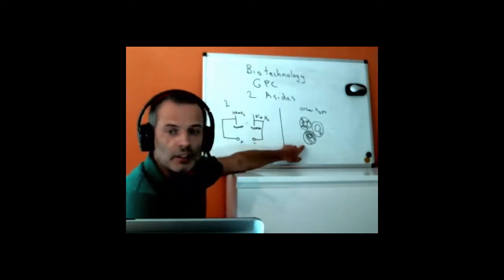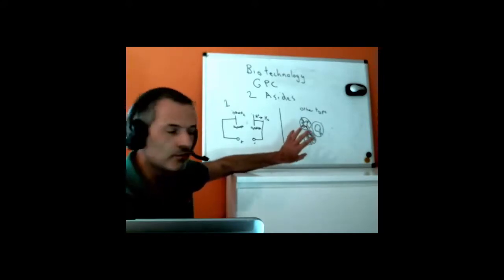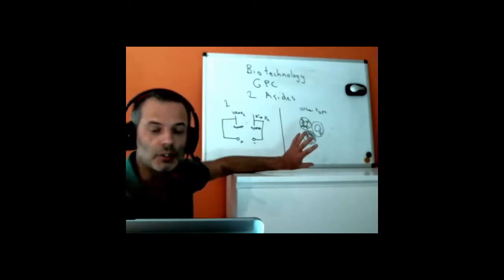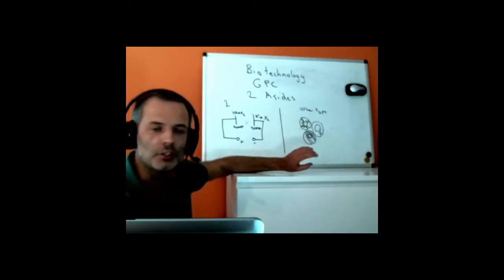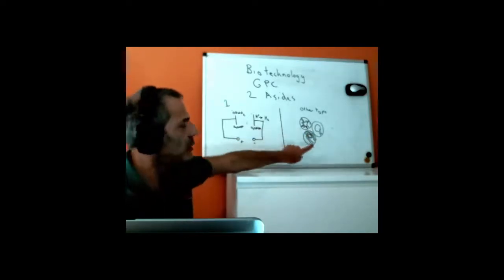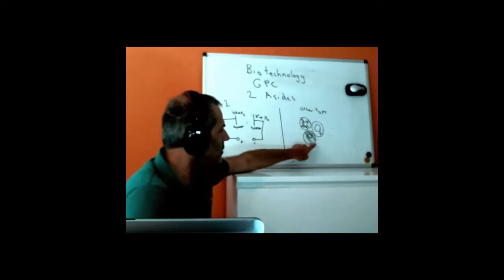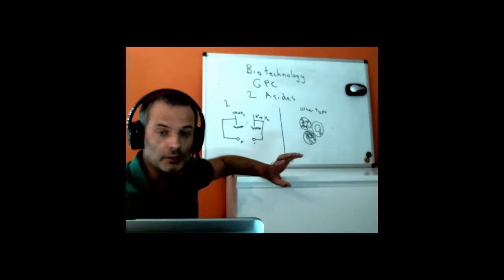On the other side, you may have remembered from polymer chemistry a different type of chromatography called gel permeation chromatography, and that works in exactly the opposite way, extremely confusingly. That confuses me, possibly confuses you. I had to look it up again today to remind myself which one we're looking at here. This type of chromatography is different because it contains effectively beads, so we have a column with beads in it, and inside the beads are small pores that the molecules can get lost in.